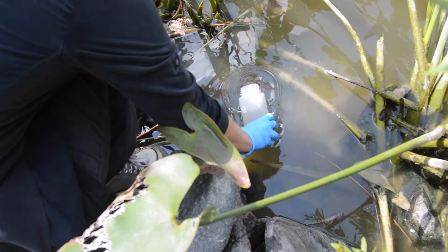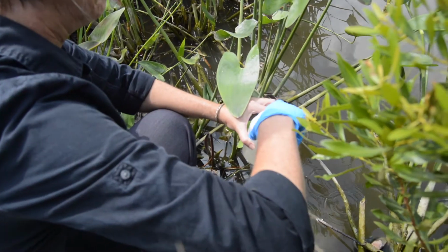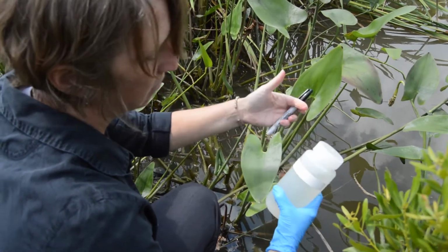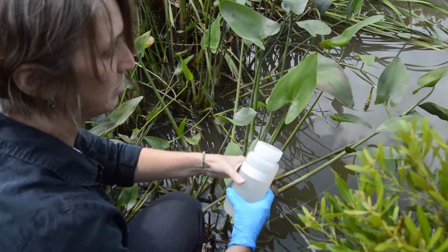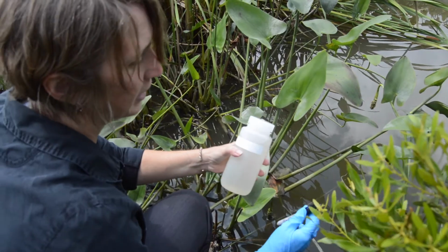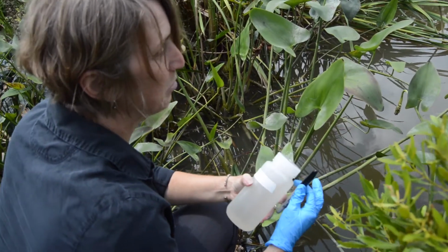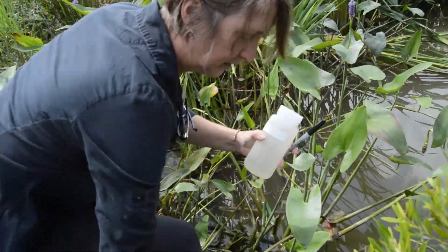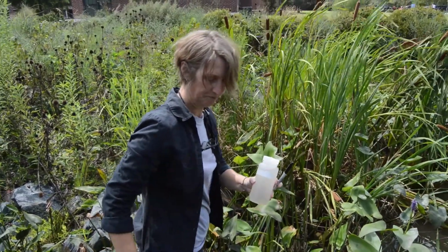This is a little bit low. It's a little bit shallow, but generally you want to get a fairly large sample just to get a good representative sample, but you can always take multiple small samples as well. And then I usually try and label it as soon as possible. I usually have labeling equipment come out with me so that I can label things right after I collect them, before I take them back to the lab for analysis, so I can identify them easily.